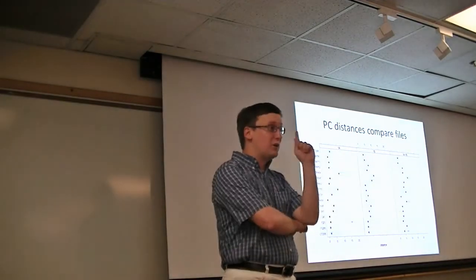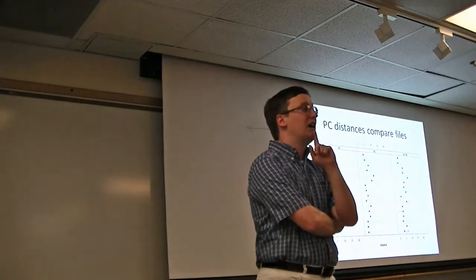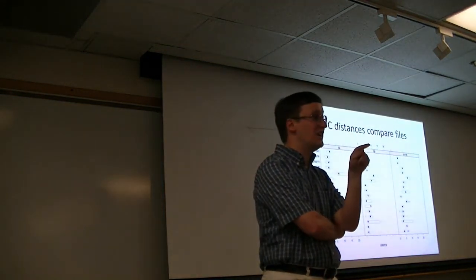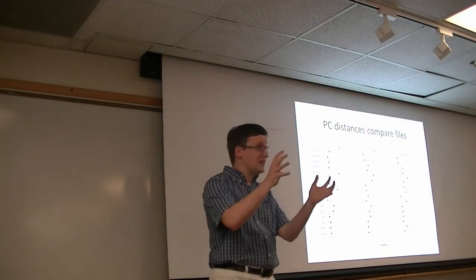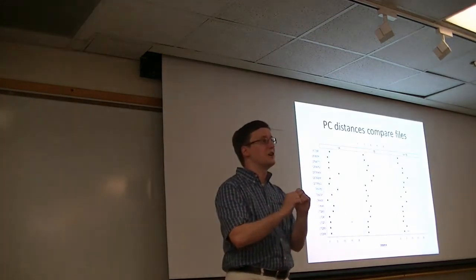So if you have 10 experiments from an instrument, you can say, I am going to make 45 comparisons, 10 times 9 divided by 2. So now we have these distances among all the experiments produced for this instrument.